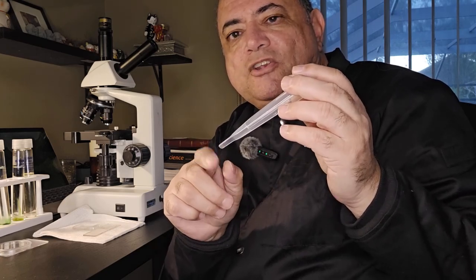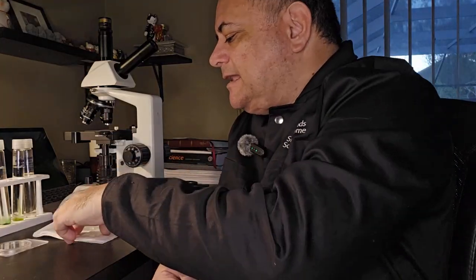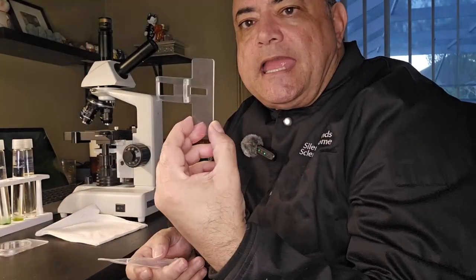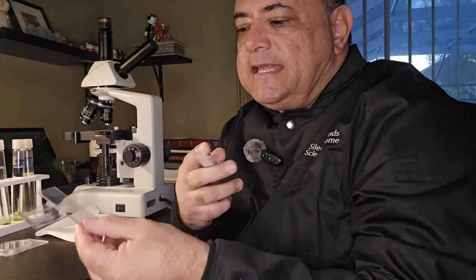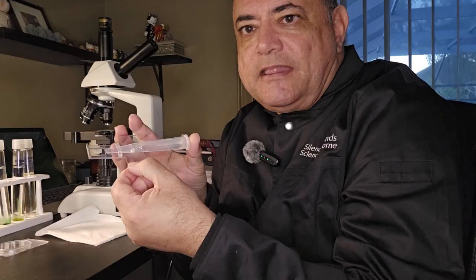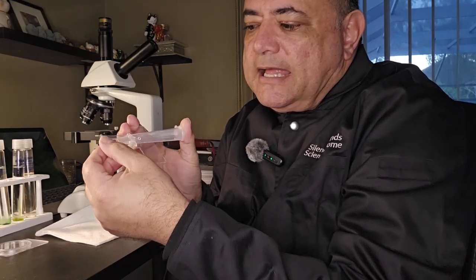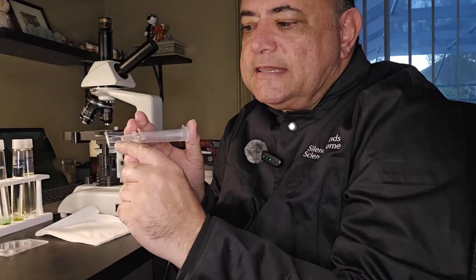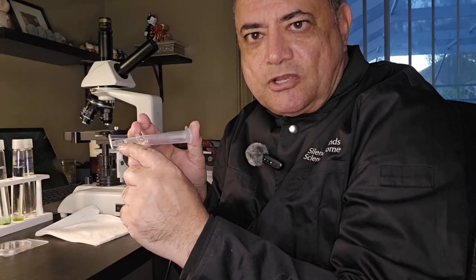So you want to get your culture, your liquid, down into this tip. And then this is a demi slide holder. Basically this sits on your microscope slide, and this slips into the slide like so. And then you view that little tip end of the demi slide under the microscope.